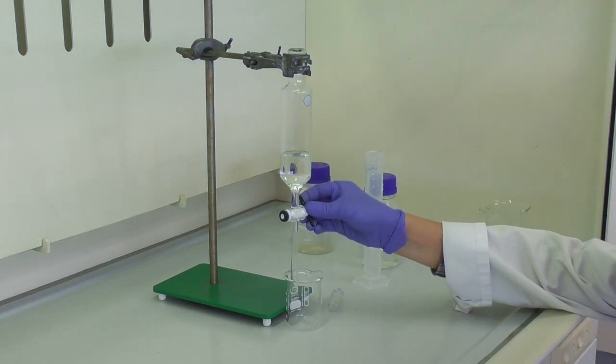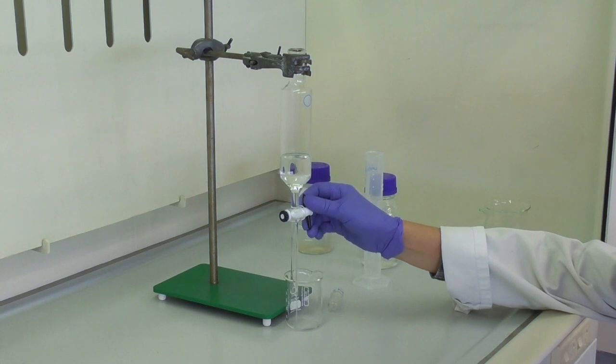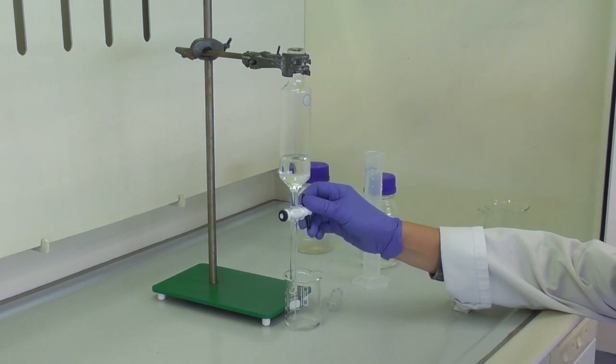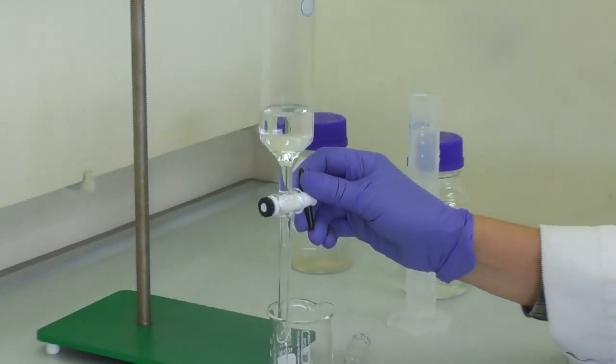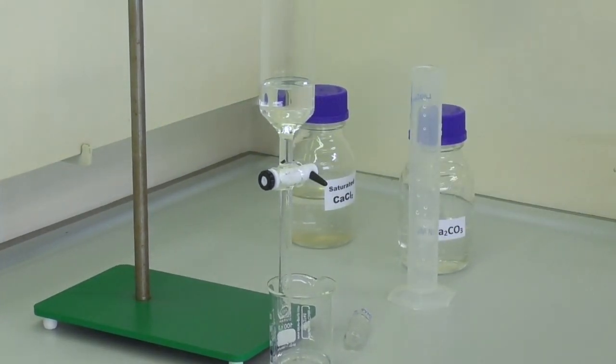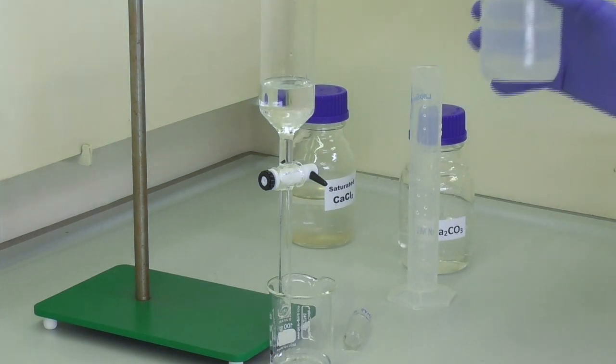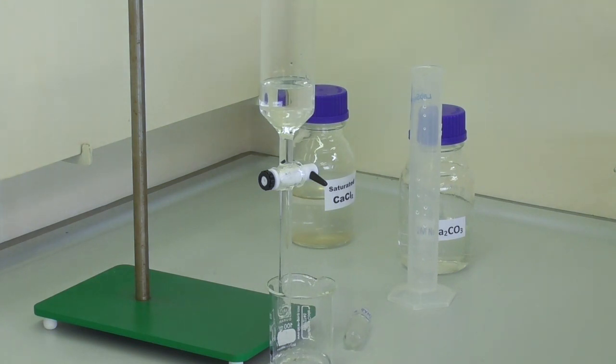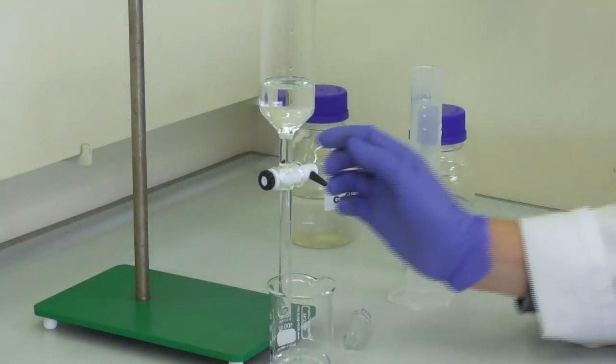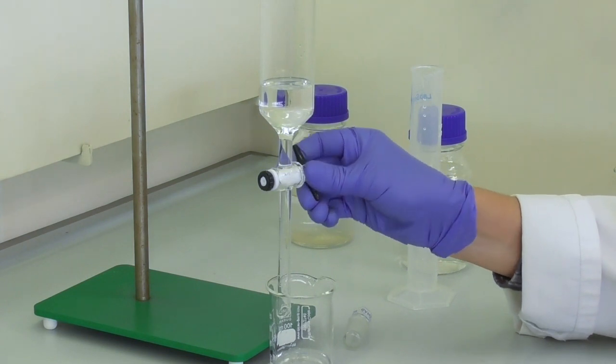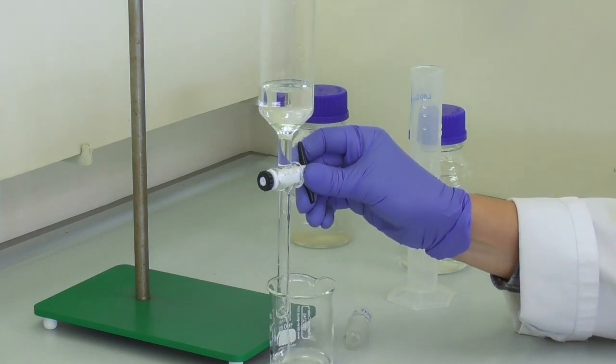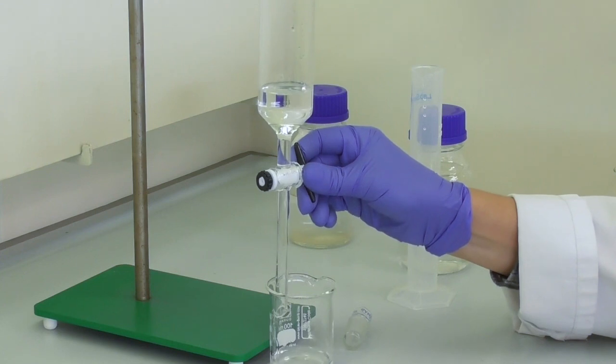We clamp the funnel and drain the aqueous layer. Sometimes it's hard to see where the interface between the two layers is. At that point, we can add a few drops of water which will make it easier to see where the aqueous phase ends, and then we can complete draining the aqueous layer.